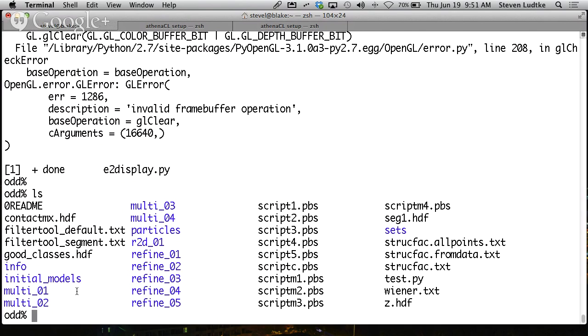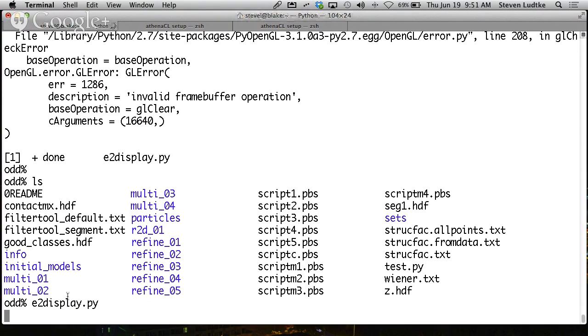Now this process isn't absolutely perfect, and there are other programs like E2ClassifyLigand which can be used to maybe do that particular process more precisely. But if you're looking at more sort of continuous heterogeneity, some molecule that moves and has dynamics and stuff, you may need to subdivide it into, say, 4 or 5 different groups, and there may be broad dynamics across the whole structure. And in that case, the multi-model refinement is definitely the correct answer. So let's take a look at what we get in a multi-model refinement.